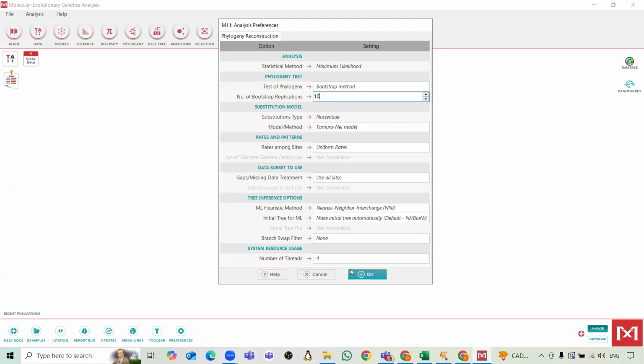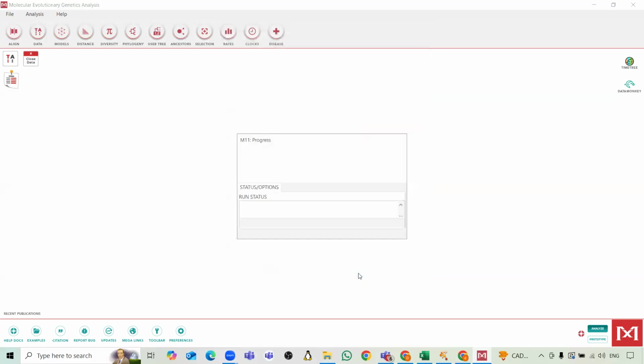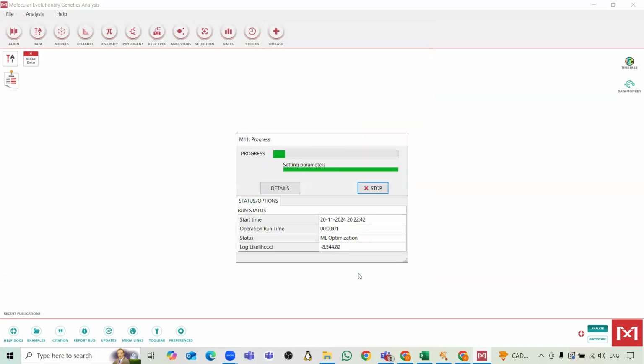Okay? The rest of the things like the number of threads. So number of threads also, as per your system, you can mention and then click on OK. Any doubt here?